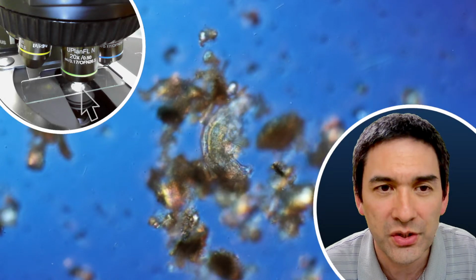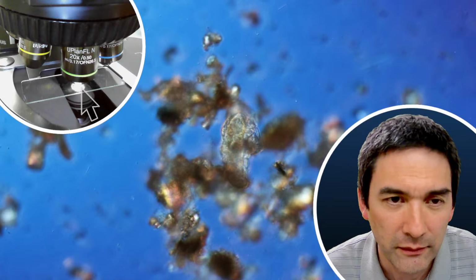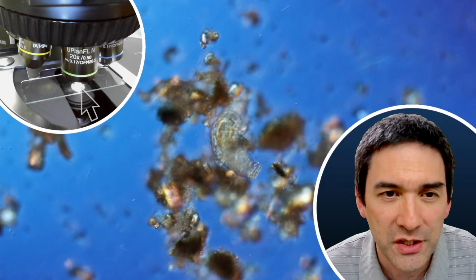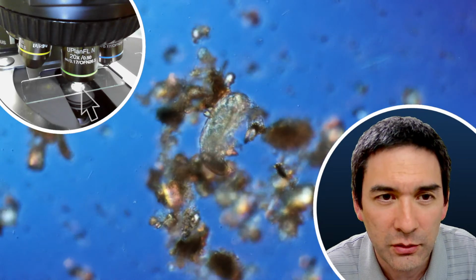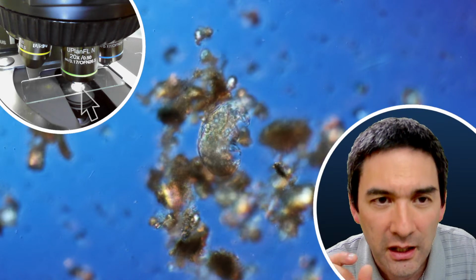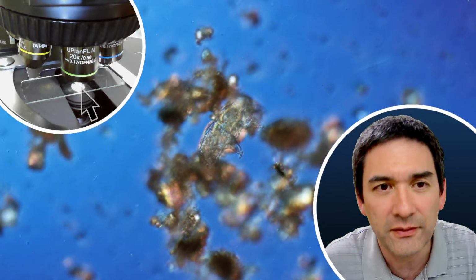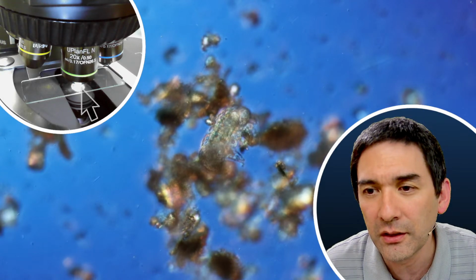So in other words, correct me if I'm wrong, I think tardigrades don't have eyes as such, because otherwise you would see the eyes as dark spots. Because if you want to absorb light, then there has to be a pigment there, and then it must be darker. But I've not seen any dark spots on a tardigrade that could resemble eyes. Yeah, but still, maybe they are light sensitive, and they might either move towards or avoid light. So this is quite possible.